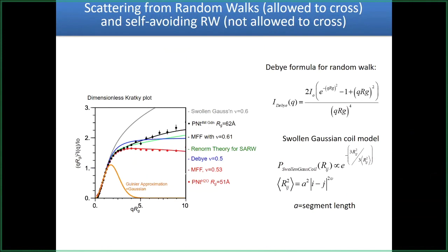And so water, even if you rescale the overall size and shape, water you can't rescale out. So when somebody says, where does water matter? I can say below around 0.2 inverse angstrom, I can sort of ignore it. Below 0.2 means bigger distances. But if I go to higher Q, we're looking at more subtle features. So it turns out if you properly hydrate a molecule and rescale for a small one and a big one, put them on the same Kratky plot, they'll generally agree in this part of the curve, but at the higher Q, they'll start to disagree.